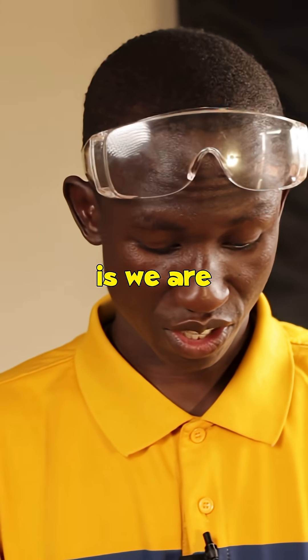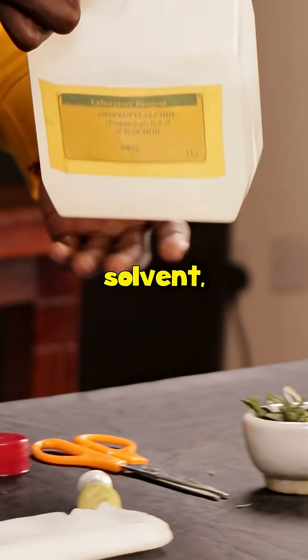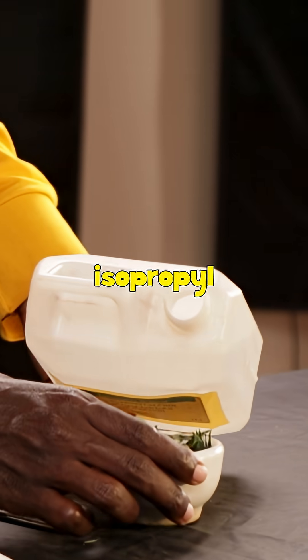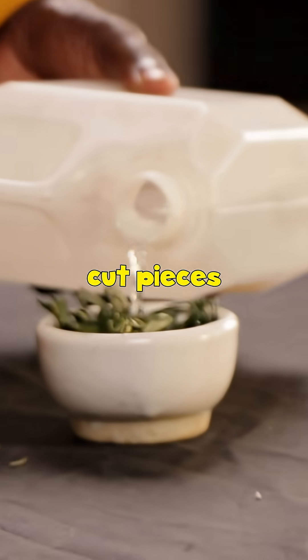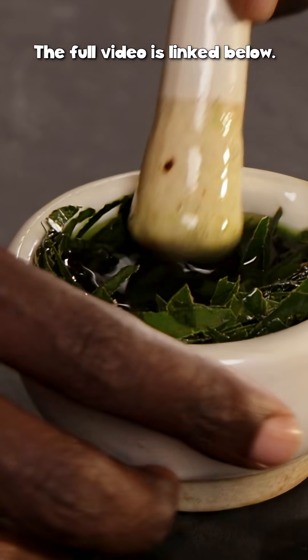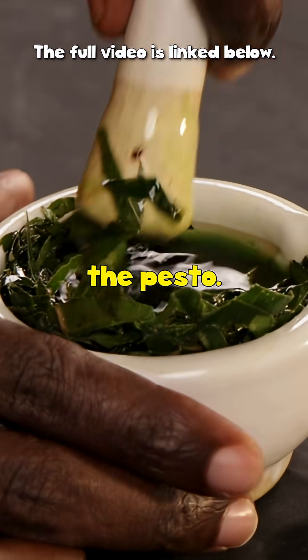The next step is to get the solvent, which is isopropyl alcohol, and pour it into the cut pieces inside the mortar. Then after this you have the paste.